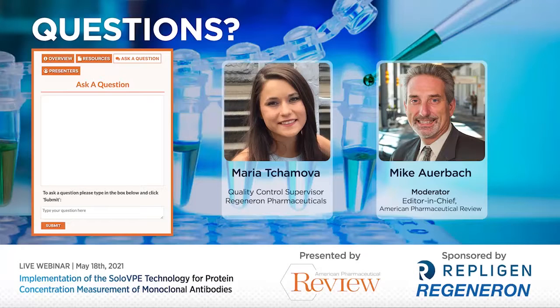Yeah, another great question. Obviously, in research and development environments, it's a bit easier to implement technology like this as we don't have as many regulations and as many written procedures in place, but we do still collaborate very closely between our R&D and our QC and manufacturing departments to make sure that we're aligned across the board on our best practices. We oftentimes will share target and expected concentrations between groups as we transfer material or transfer other types of methods across sites. So there's continual collaboration, continual communication, just to make sure that we're all aligned across the board and across our business.